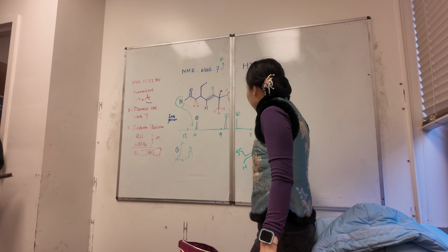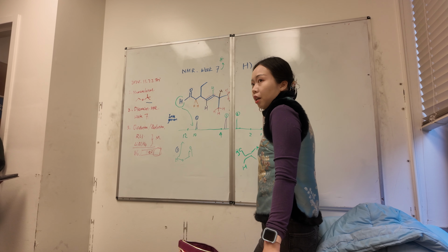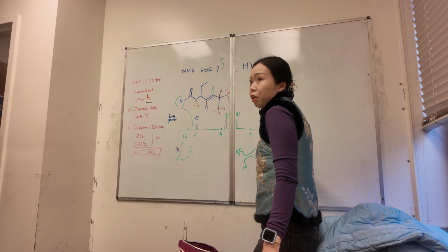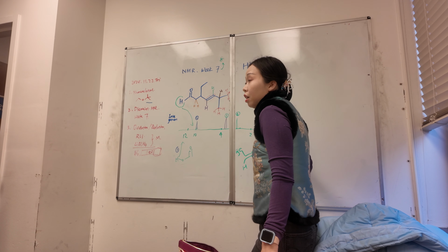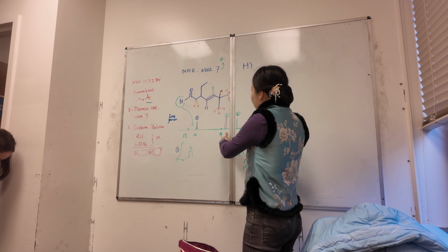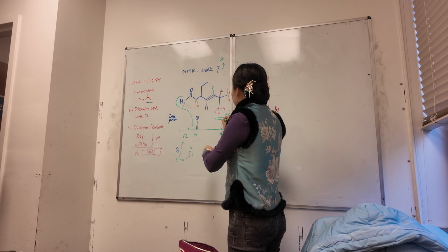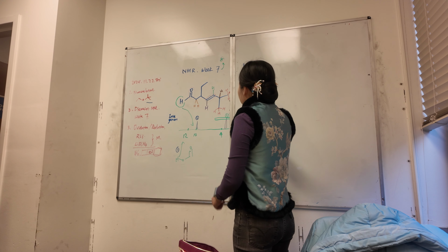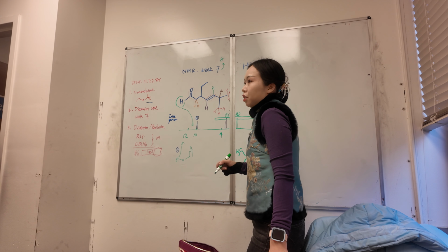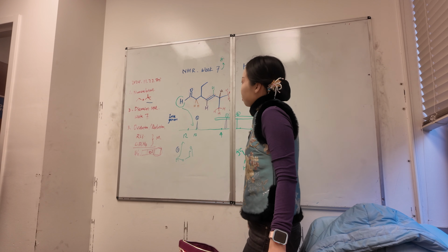I post this one, and the peaks of those, each of these 1, 2, 3 hydrogens have a different number, and they are actually 5-point-ish, 5.8-something-ish, right? The ppm. So that's why in your NMR, you will say, okay, there's a really rough range, a really broad range with sp2 hydrogen. It's really just all over the place. You cannot really tell. For now we only care about integration, okay.